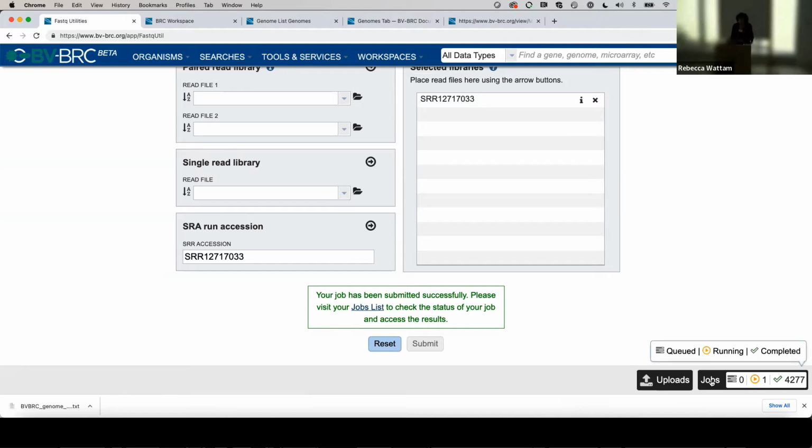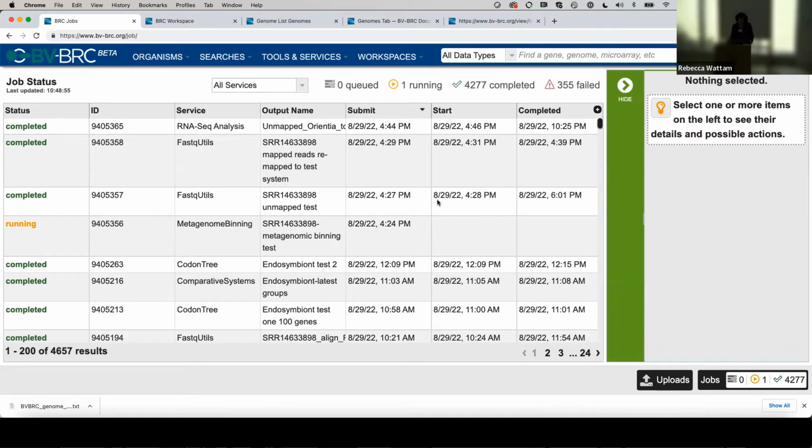If you wanted to see where the jobs were, and I don't think it's even going to show up on my jobs page yet, but let's click on that. I won't even see it registered here. It's going to take a while to move over there. Don't worry though. This is like the Julia Child cooking show. I already have a cake in the oven to show you what it looks like.